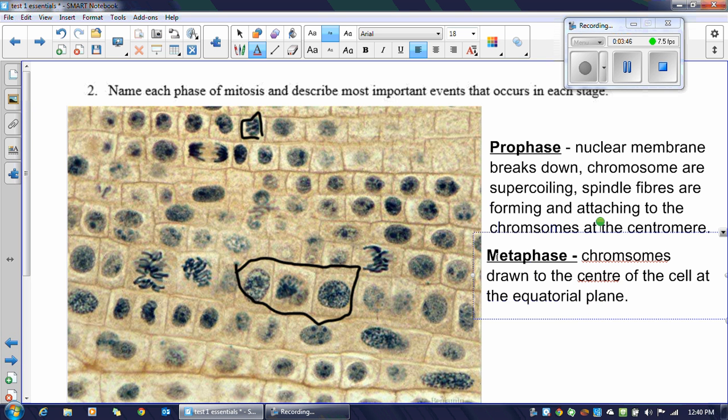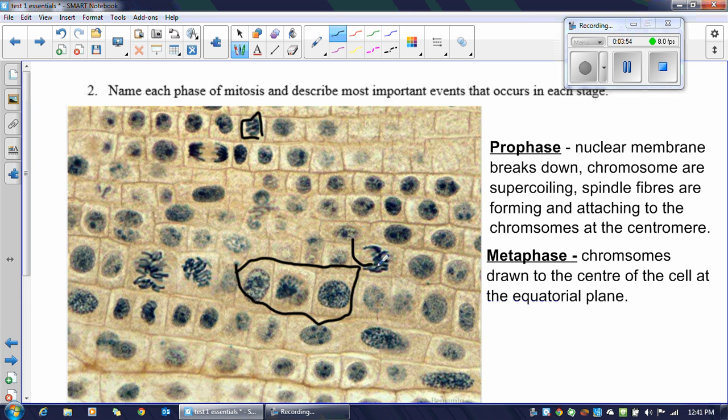And that would be our metaphase. Let me circle the metaphase here before I get too far along. There's our metaphase right there. My drawing skills with my mouse pad are not that great, I apologize. And maybe that other one right there, I'll use the mouse. Maybe a little better at that.